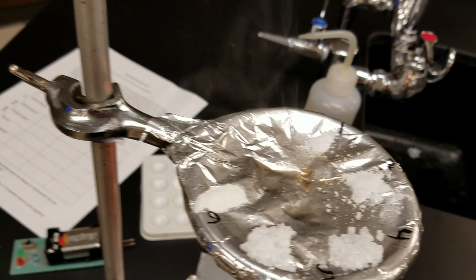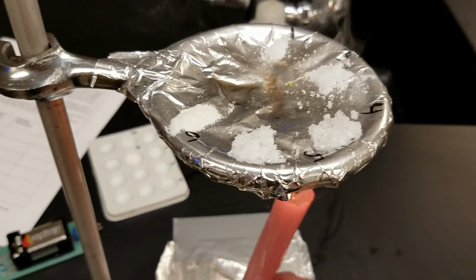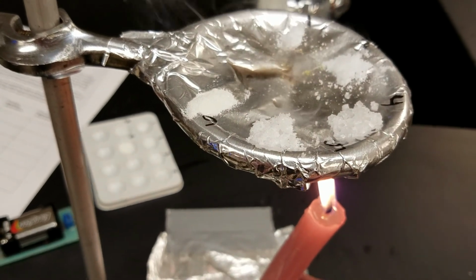We're going to move on to number 3, which is potassium iodide. So I'll move my flame just under potassium iodide.